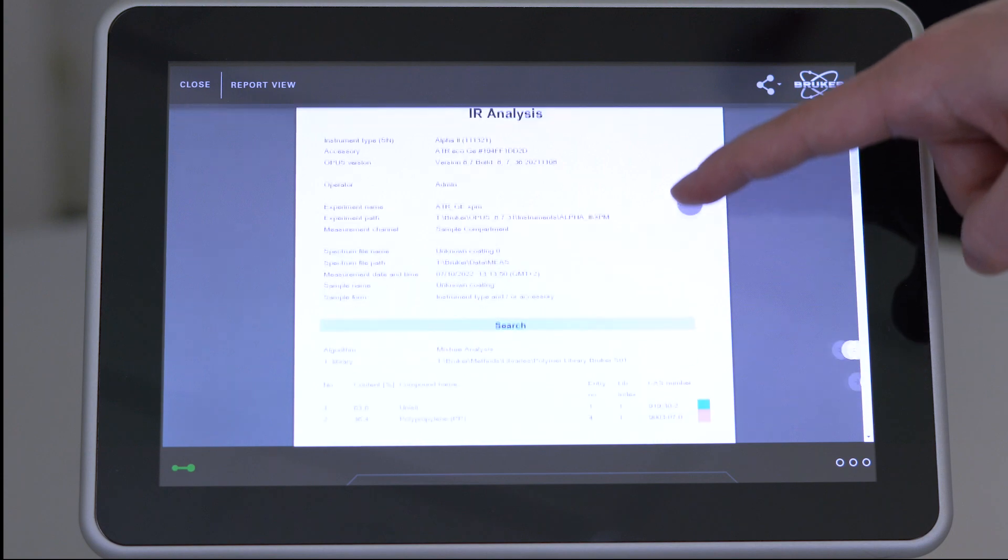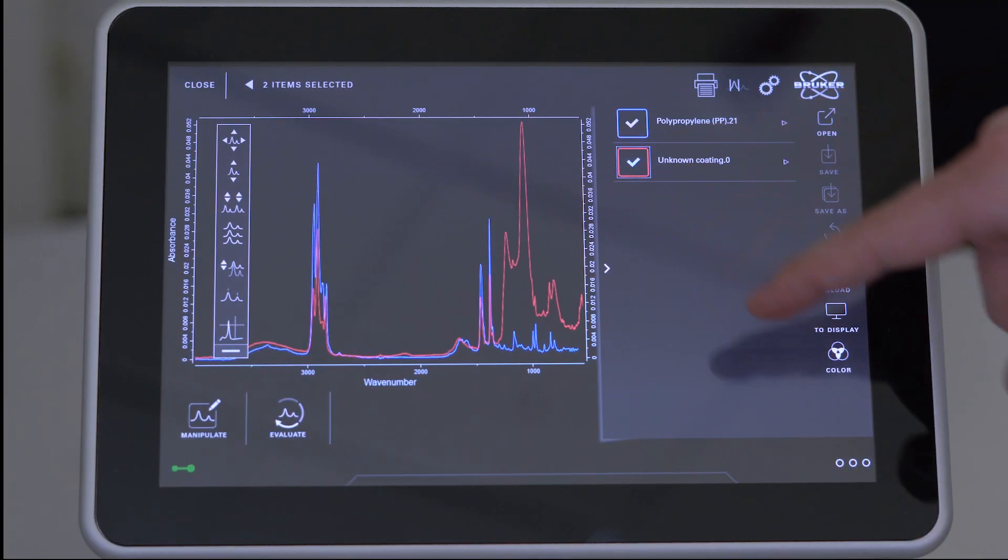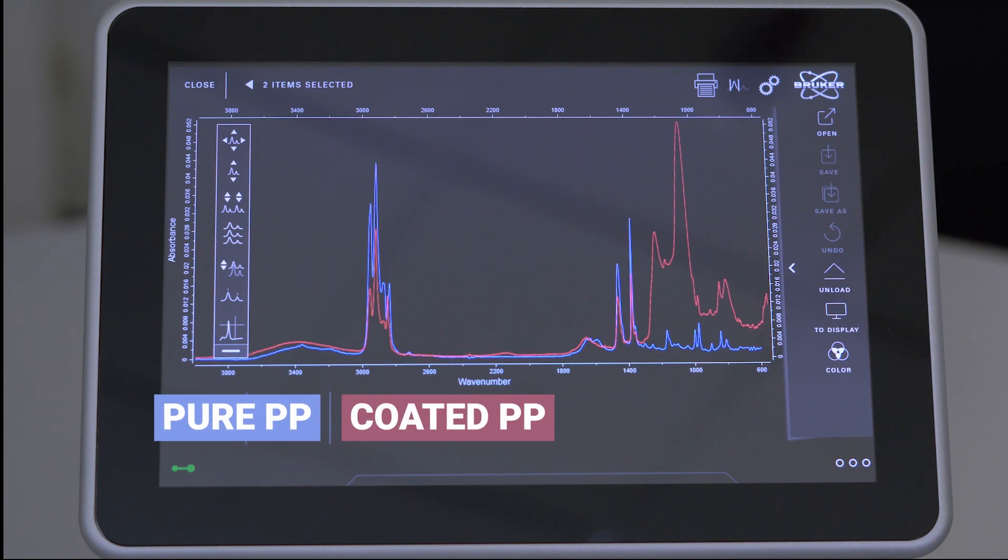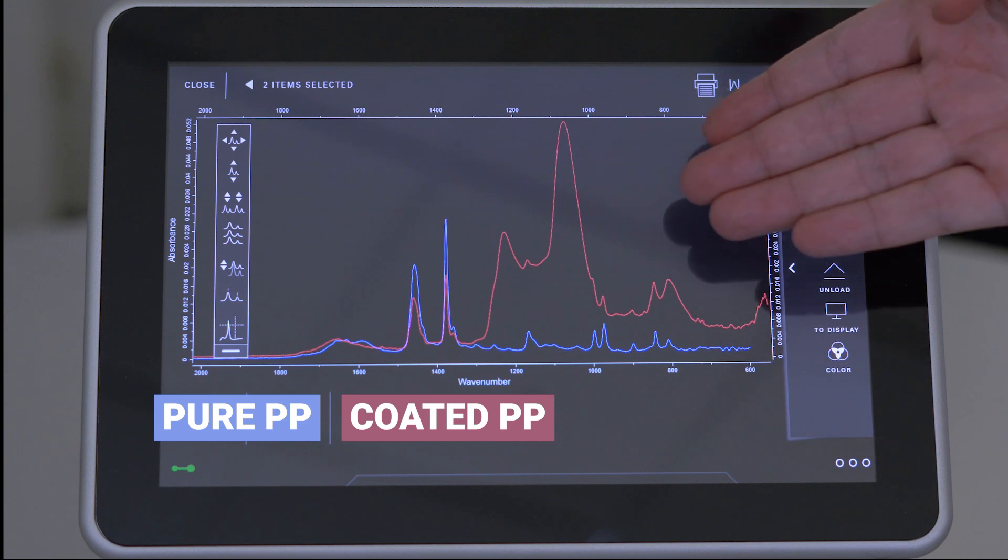Finally, as a simple verification, we can compare the IR spectrum of the coated surface with the spectrum of the uncoated backside. Now, we can conclusively tell that the coating is present and intact.